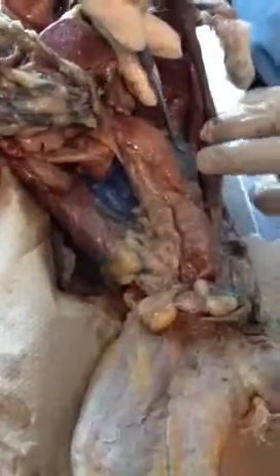In terms of the urinary system, this is ruptured through pretty badly, but that's obviously a kidney. This is obviously a ureter. This is a urinary bladder. As I pull the bladder away, this is the urethra.